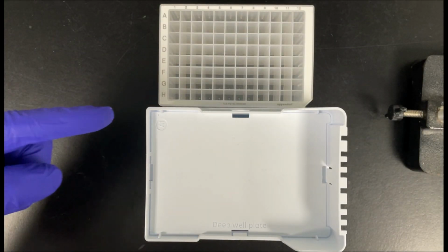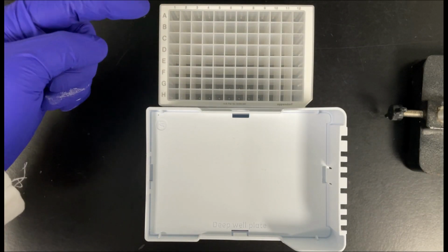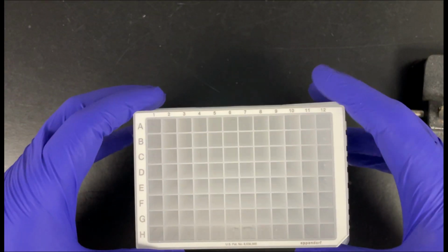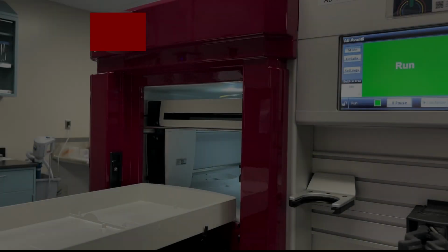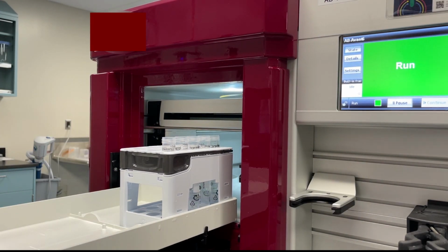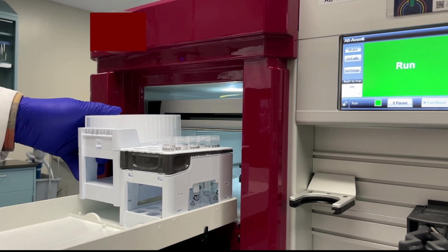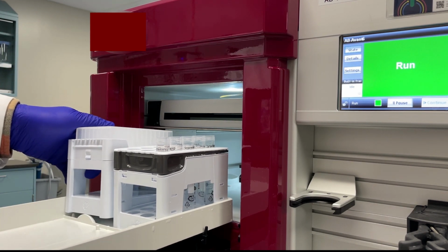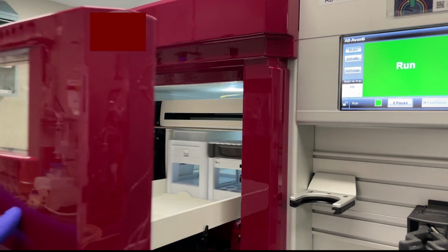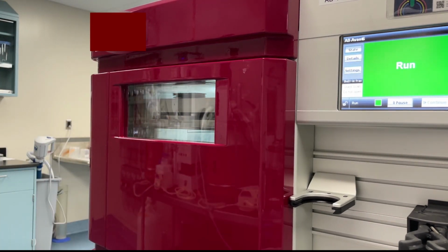For the 96 well plate, we have to make sure that the plate and the rack have the A1s line up. So we collect the right fraction into the right position. Then we're going to load the fraction collector itself. We're going to use the 15 mL tubes for the flow through and the 96 well plate for the elution. Close the fraction collector.